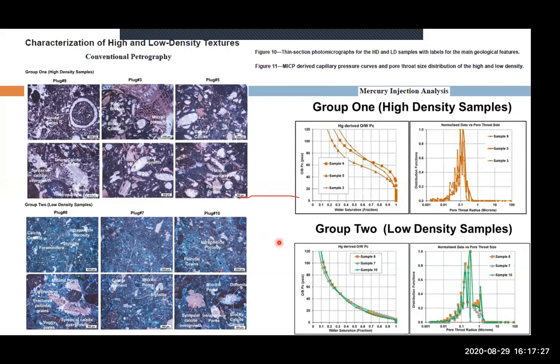You want to perform this, as I mentioned before, you can use like a wafer of your original sample, of your original plug, in this case, and you can perform this kind of pore throat distribution and see the peak of distribution. In this case here, we have a peak of around 0.1 micron. Yeah? So you're going to move to higher resolution this information. Selecting, for example, 4 micron per voxel, 1 micron per voxel, 500 nano per voxel, just to capture the majority parts of the distribution here in the smaller range. Okay, it's important.